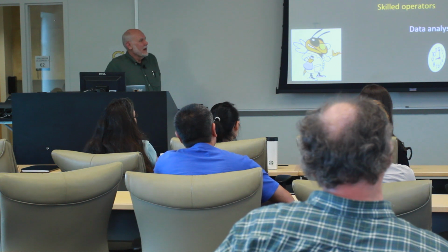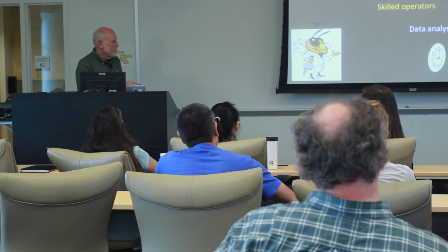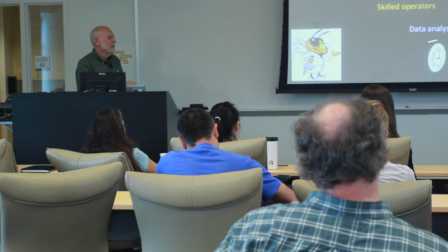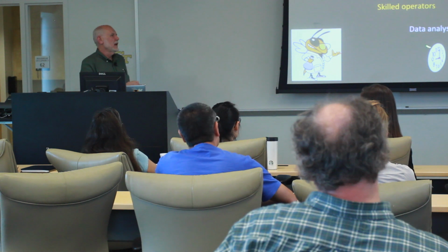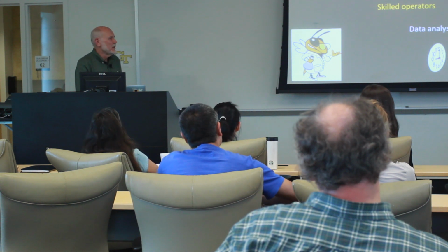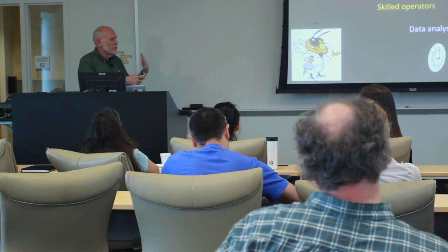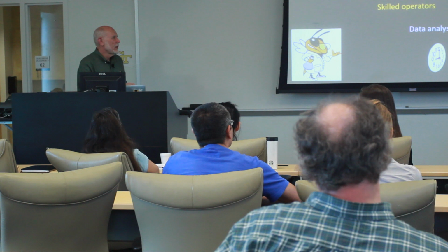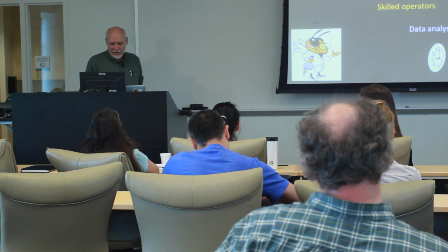And then there's really a triumvirate of items here. One is the time that you had to invest to do it. The second is the dollars, because although the instruments are in place, and that has a relatively small cost, they do have lasers that are associated with them, and if one spends a long amount of time because you haven't designed your experiment carefully, replacement of a laser can be $5,000, $10,000, $25,000, and then whatever you always need in research, which is just a bit of luck.